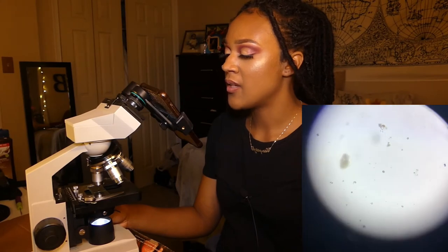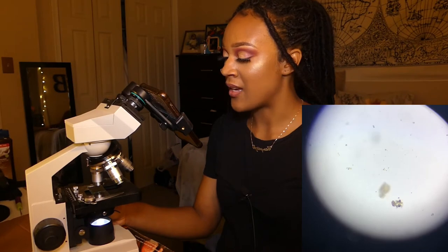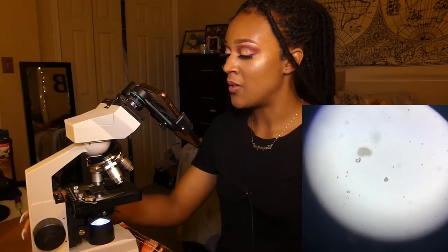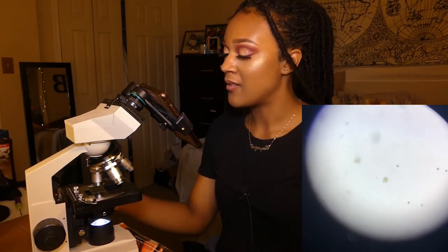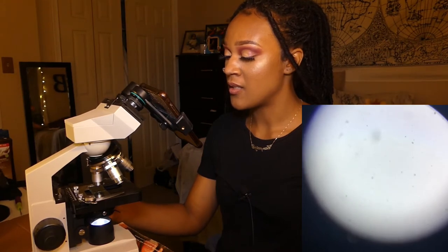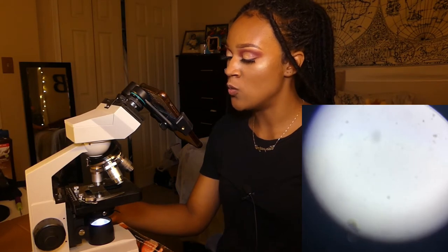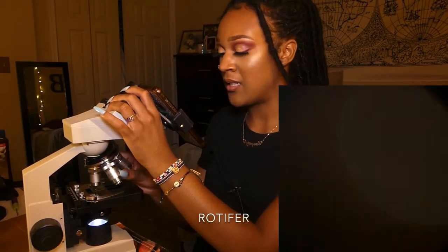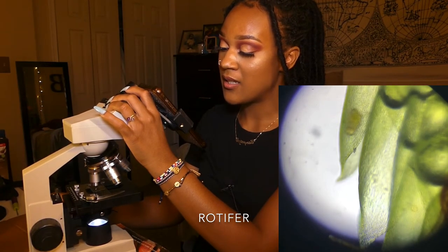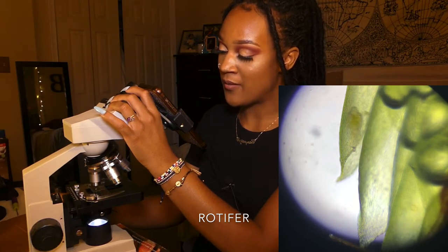Still looking. There it goes again. It looks like it has an egg sac, and it's just kind of floating around. It's hard to keep... stop moving so I can see you. Let's try to go to 10x, see if we can get a closer look. You see it?